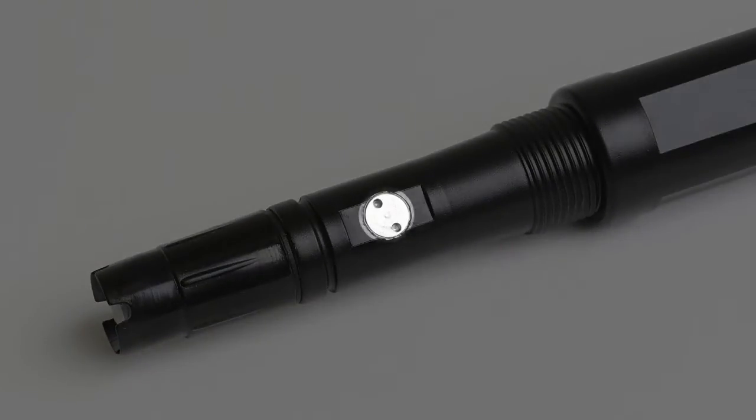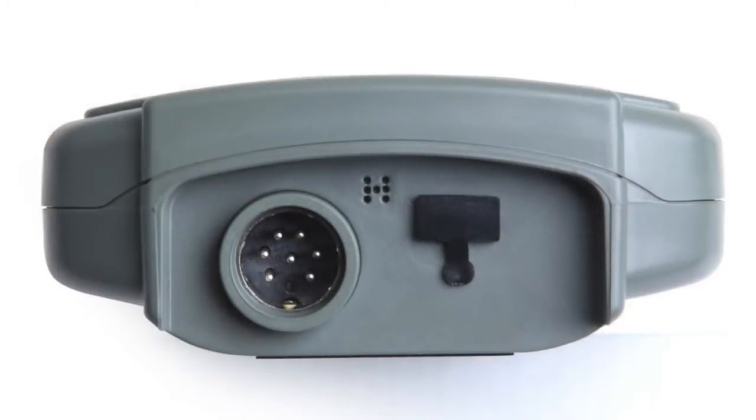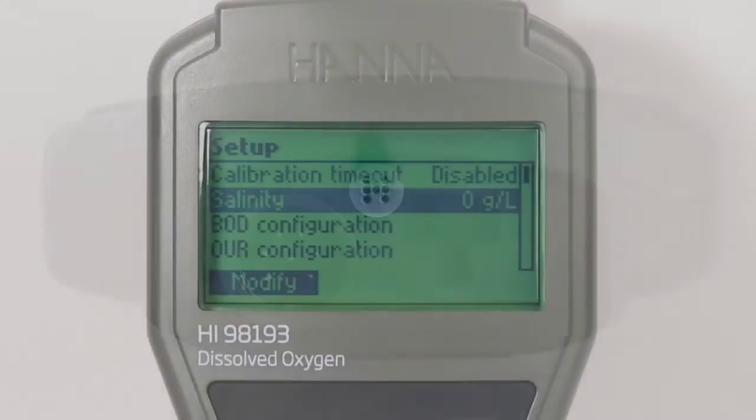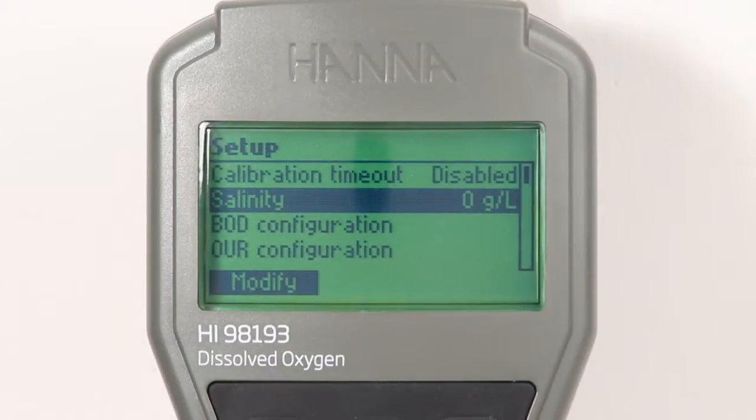The meter itself features an internal barometer which permits the user to automatically compensate for pressure. Furthermore, the salinity of the sample can be input by the user in order to enable salinity compensation.